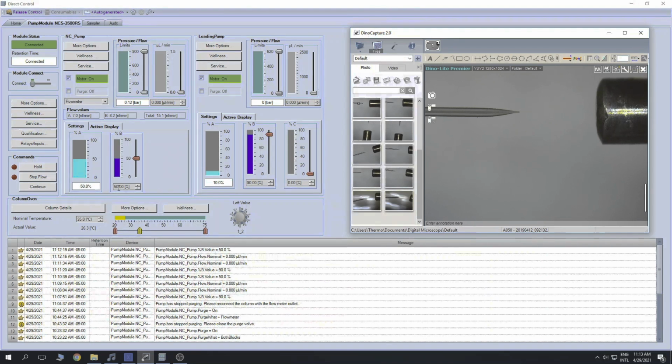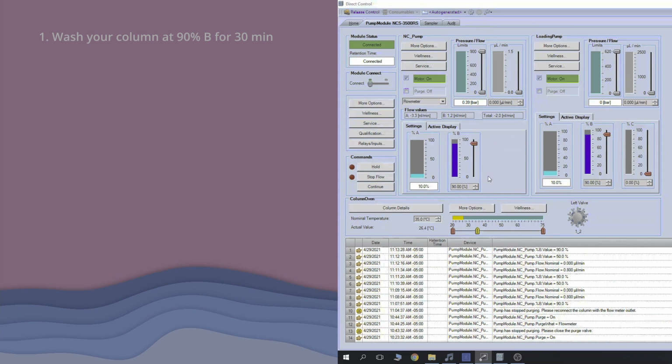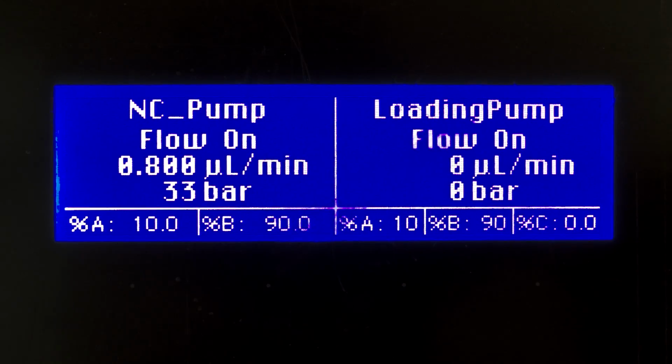Once you have your column positioned, you'll want to start with column equilibration. To do this, we will start with our solvent percentage at 90% B, as this is what your column should have previously been stored in. Nanocolumns have a typical flow rate of anywhere from 0.3 to 1 microliters per minute. I run my column at 0.8, so I'm going to set the flow rate to 0.8 microliters per minute.